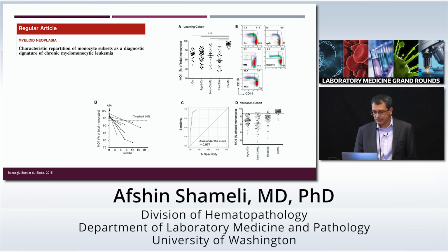That's based on this study, which looked at CMML patients and compared these patients with different populations such as age-matched controls, as well as patients with non-CMML hematologic malignancy, as well as patients with reactive monocytosis.